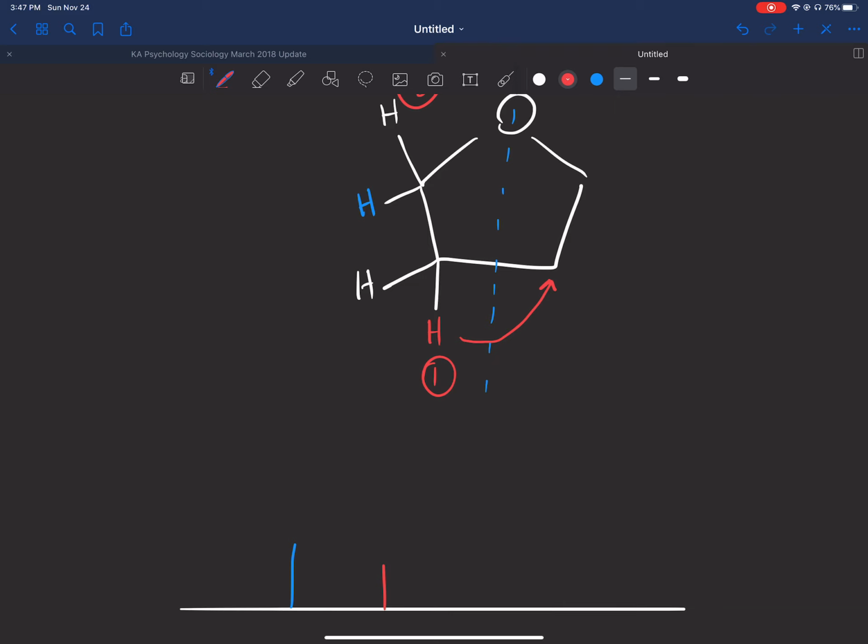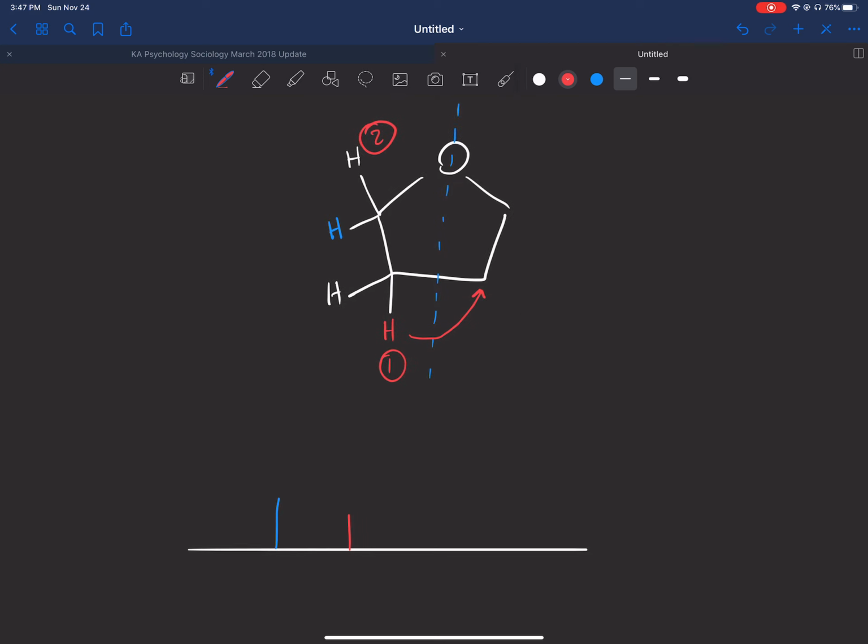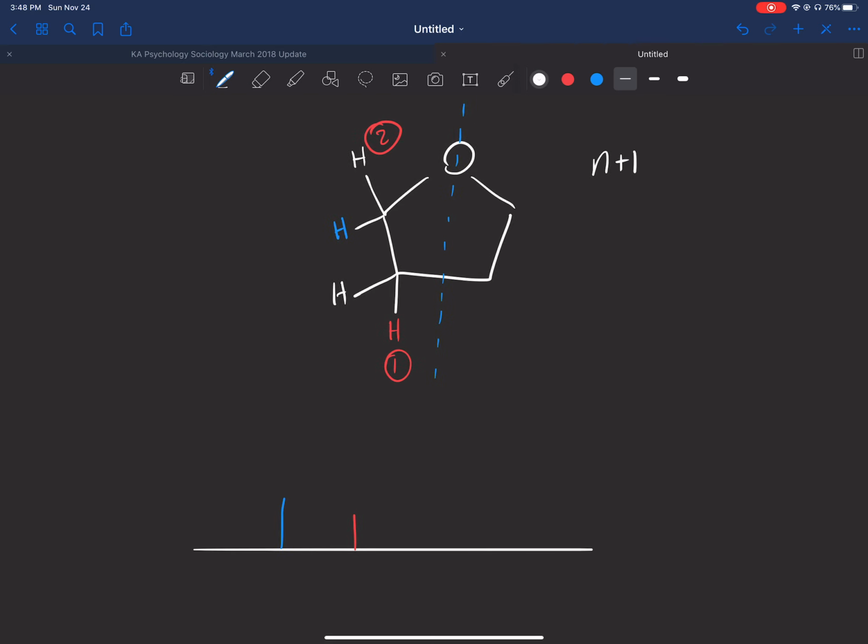They're the same thing. Remember that in HNMR, hydrogens that are the same don't see each other. So these 2 hydrogens here do not contribute to any splitting. The ones above this red hydrogen do. The way we talk about splitting is called the N+1 rule. You take the number of hydrogens on the carbons adjacent to your hydrogen. That's going to be this carbon right here, and I'll color it green.